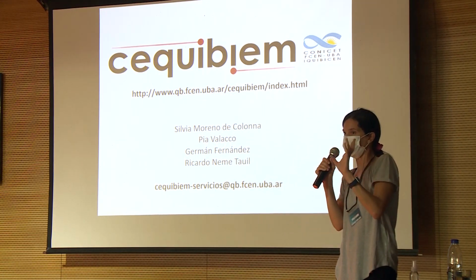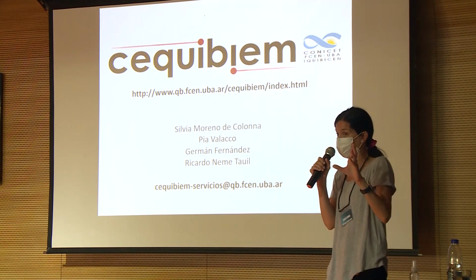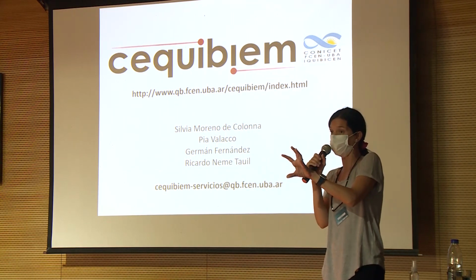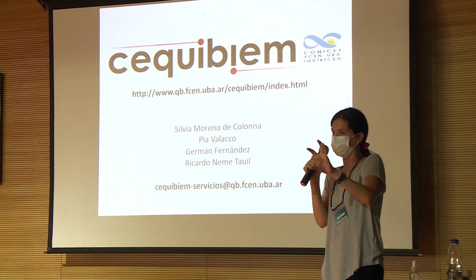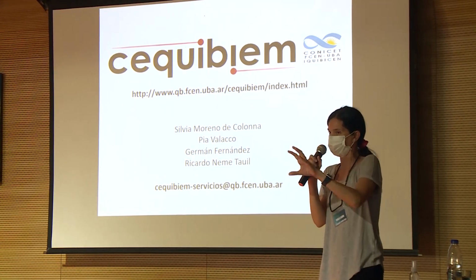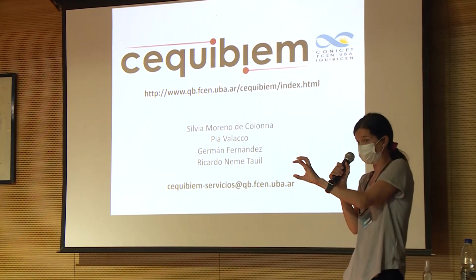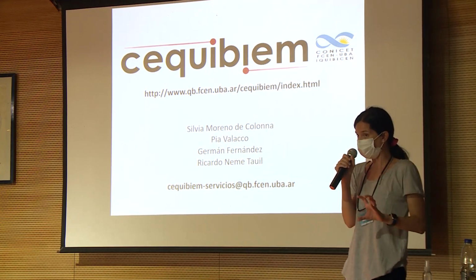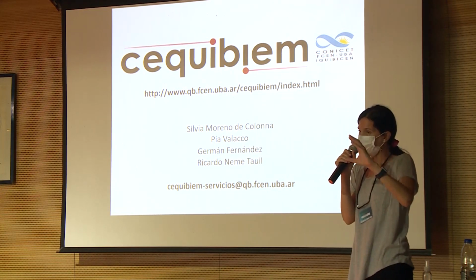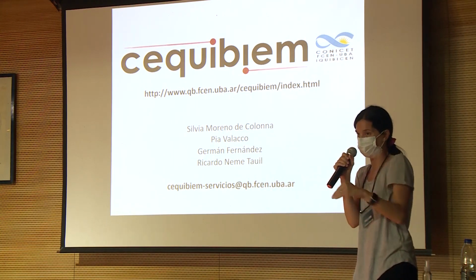So in that case, what you're asking might happen, but in that case you don't have the Orbitrap analyzer. The analyzer there is the Q3. You don't have the Orbitrap there. In the case of the Q-Exactive, which has the quadrupole and then the Orbitrap analyzer, the quadrupole there only acts for filtering or focusing the ions so that they fly better into the rest of the equipment.